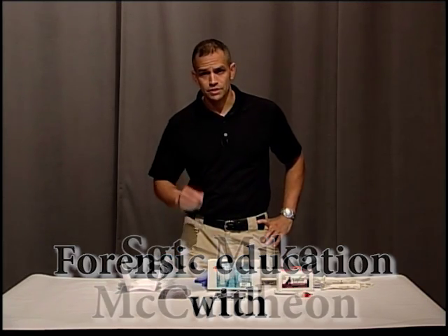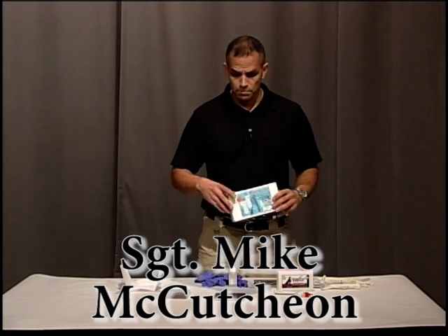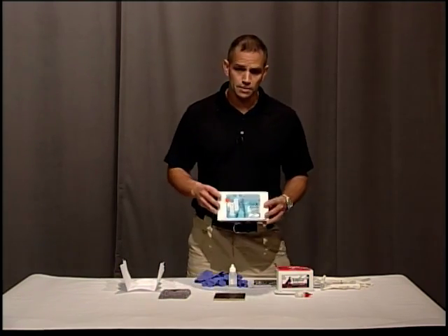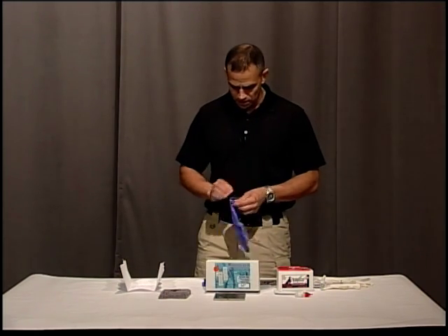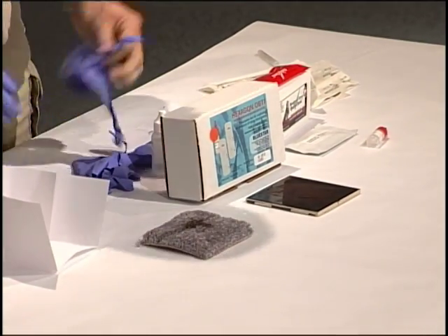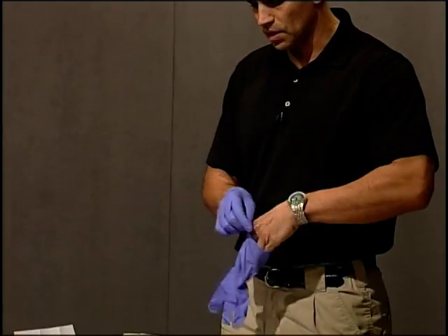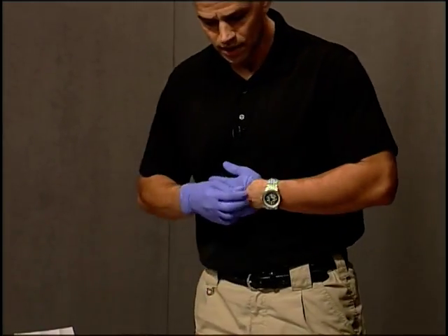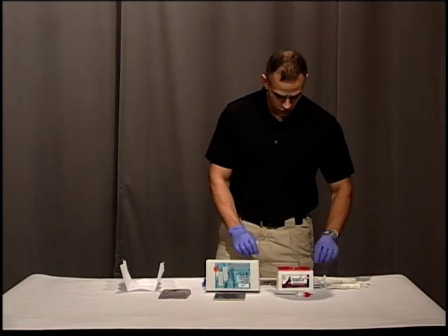Hi, welcome back to Forensic Education. I'm Sergeant Mike McCutcheon. Today I'm going to show you how to test blood stains to see whether or not they're human blood or animal blood. I'm going to put my gloves on. What we'll be testing for when we're testing for human blood is actually the hemoglobin in the blood. When testing with other products, they may be testing for the proteins in the blood, but we want to make sure that what we're testing is for human blood.